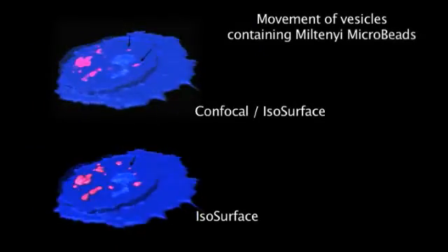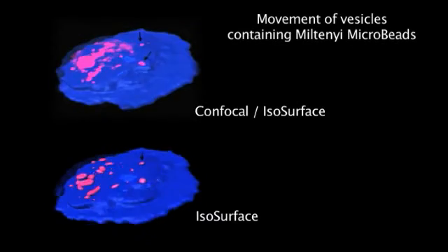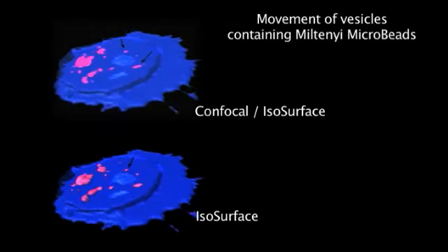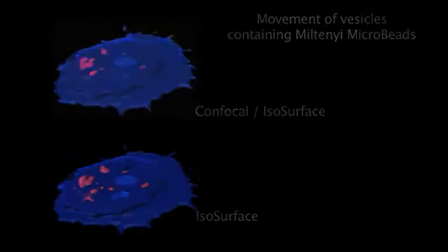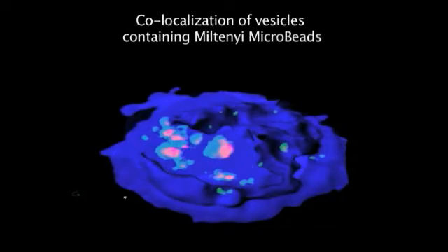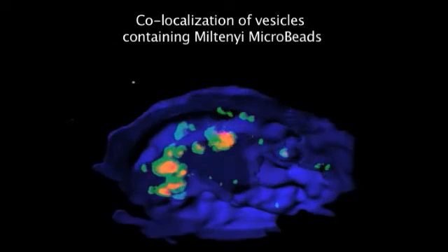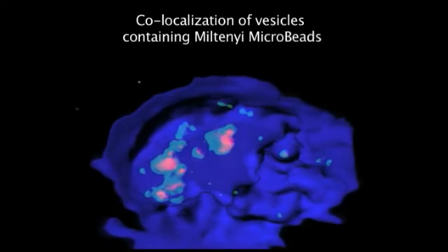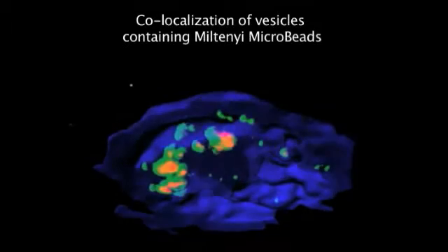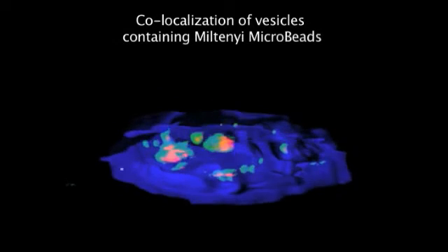Here, the arrows demonstrate movement of vesicles containing the Miltenyi microbeads. Using isosurface imaging, we see the vesicles containing the Miltenyi microbeads are co-localizing with acidic compartments. Acidic vesicles are labeled with LysoTracker green, and yellow color indicates co-localization with the Miltenyi microbeads.